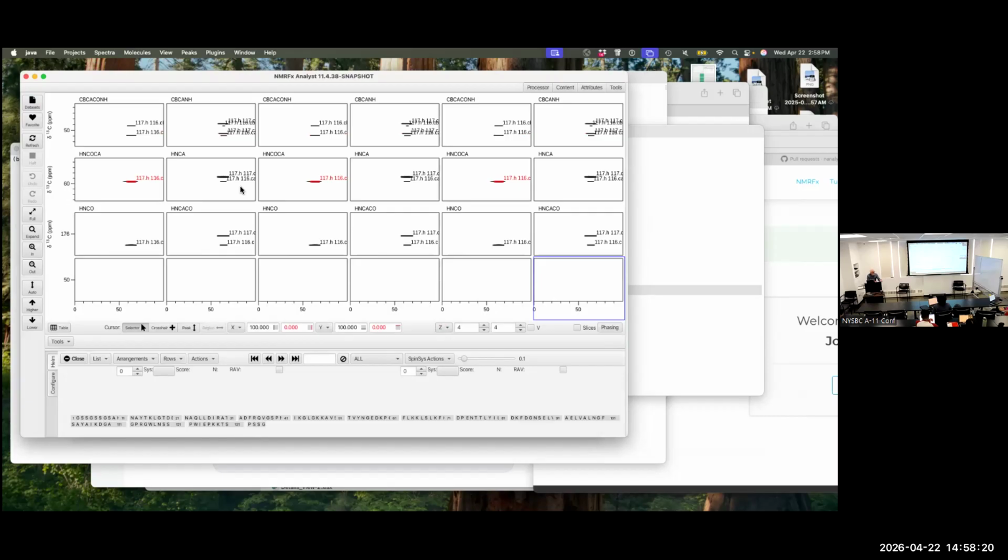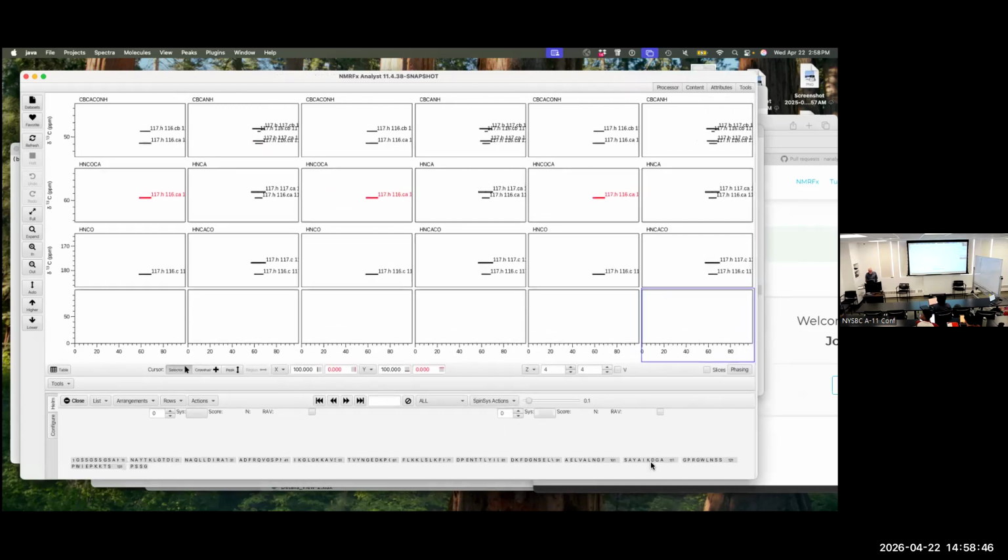A lot of them came from the Northeast Structural Genomics project. So they have backbone and side chain and NOESY experiments, basically everything you need to solve a structure. I kind of move on from ubiquitin a little bit. So instead of using ubiquitin as my demo, I'm picking one of these that we've been playing with lately and testing things out. Okay.